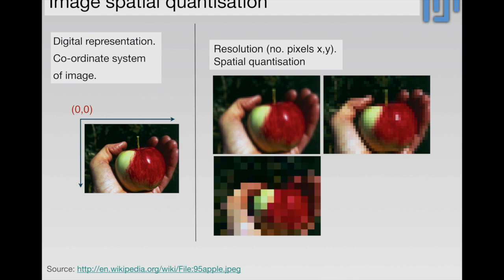So for example, you may have a microscope that's resolving individual organelles, but the question you're asking is really about how many cells do I have in an image as part of a population. And in that case, you could actually lower the resolution so that you can just resolve the individual cells rather than necessarily being able to resolve the organelles. And the reason you would do that, the reason you would throw away that data, is so that you could save on memory and also on processing speed. So a larger image, and this is a theme that will come up again, a larger image is slower and more expensive to process. So if you can, and if it doesn't contravene any of your other obligations, it's always a good idea to downsample the resolution if you can.